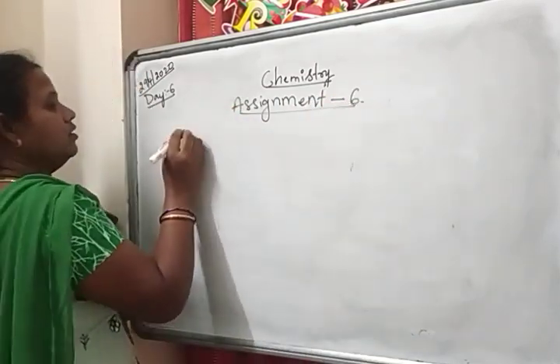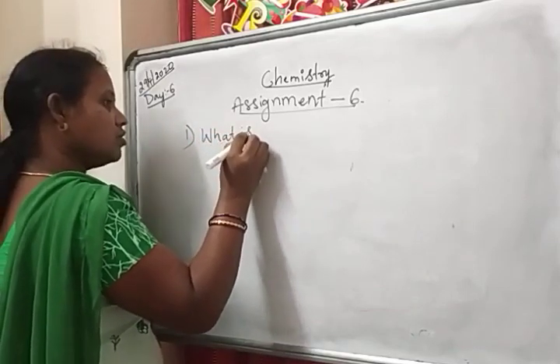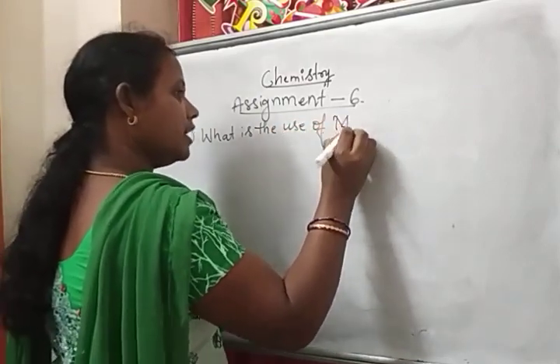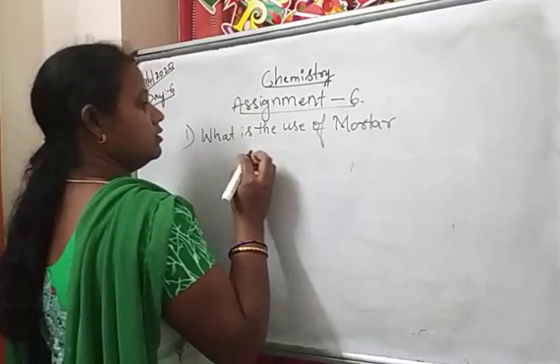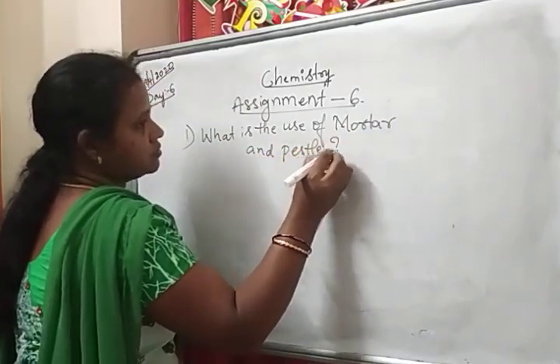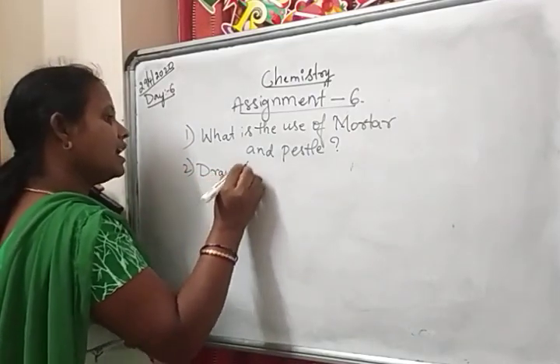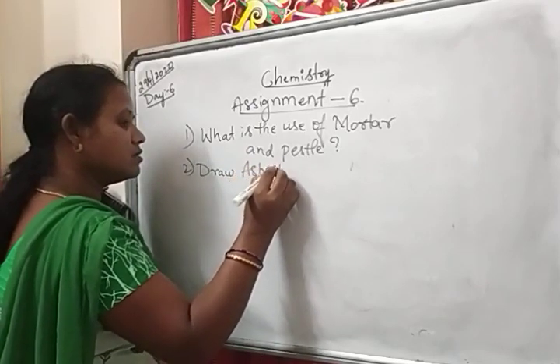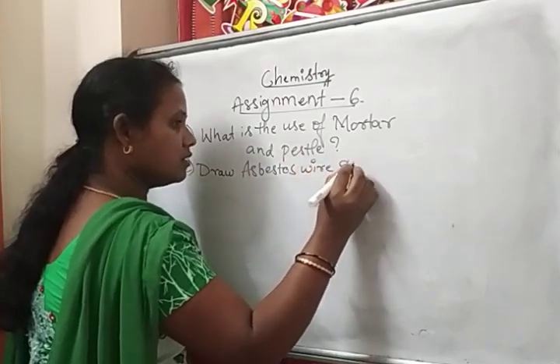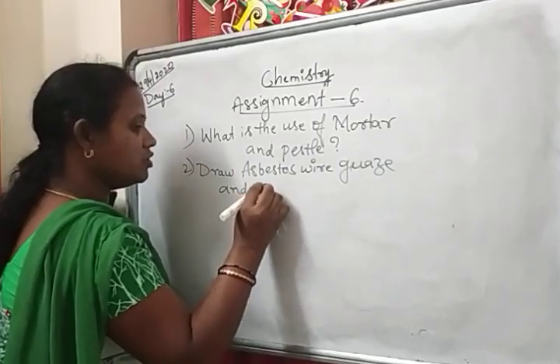First question: what is the use of mortar and pestle? Next, draw asbestos wire gauze and give its use.